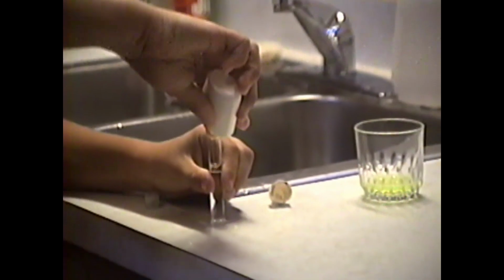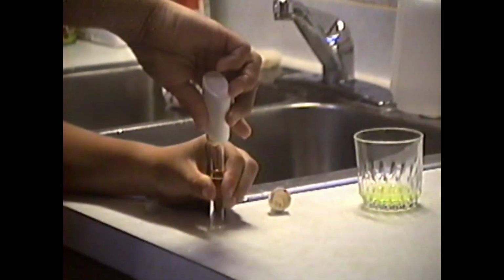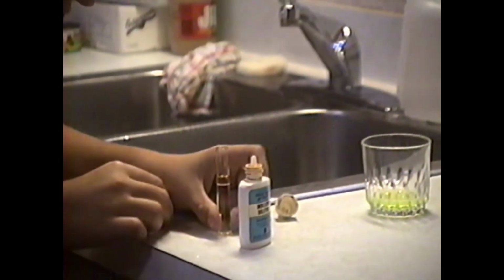Put 1, 2, 3, 4, 5, 6 drops of indicator solution. Mix it up, and as you see, it's way over here off the chart.